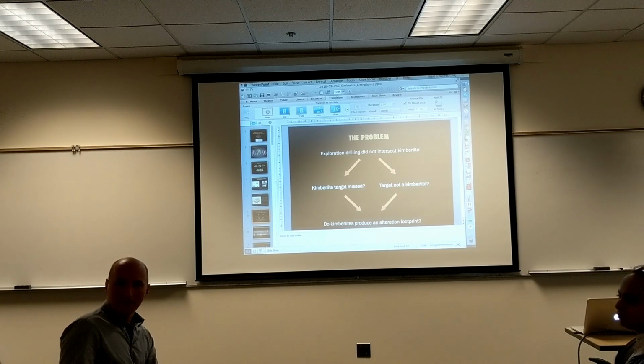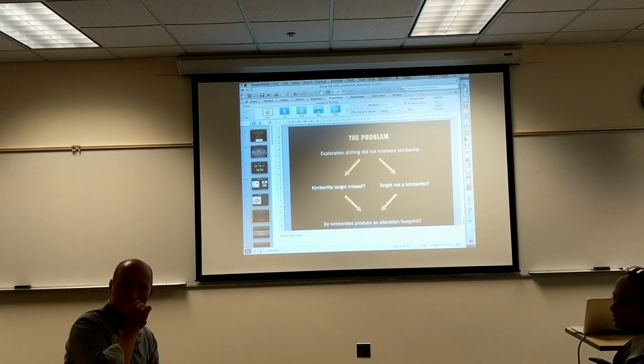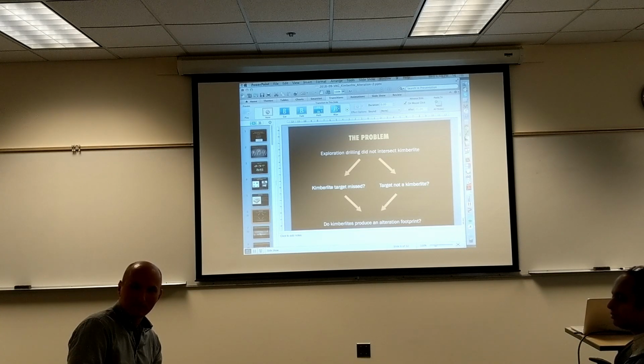Just a quick comment about your idea that the water is actually on the grain boundaries. You can correlate it with traditional XRF analysis. When you ask for LOI, loss on ignition, you can differentiate between moisture and high temperature water. So your water should be in the moisture, low temperature water, and you can check that there's a correlation between XRF and your hydration. Yeah, you should be able to heat up the samples and measure the loss.